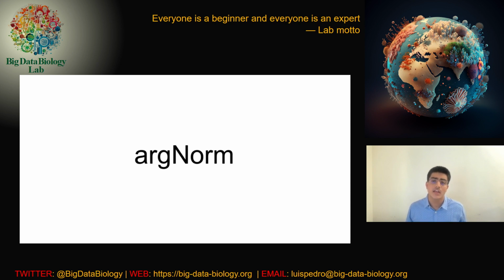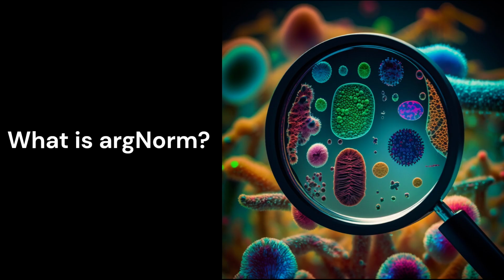Today we're diving into the ARG Norm package. We'll explore what ARG Norm is, why it is useful, and how to use it.